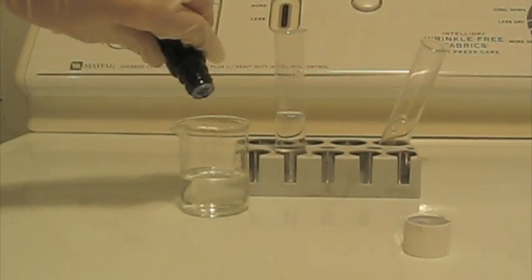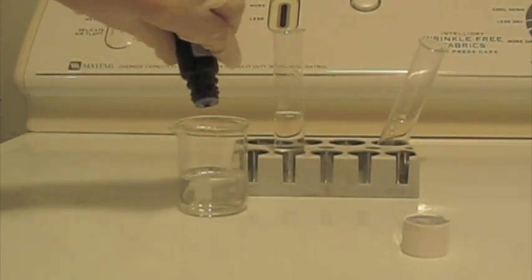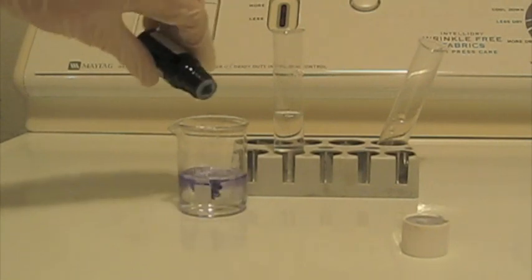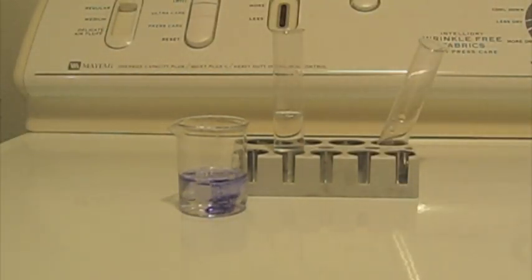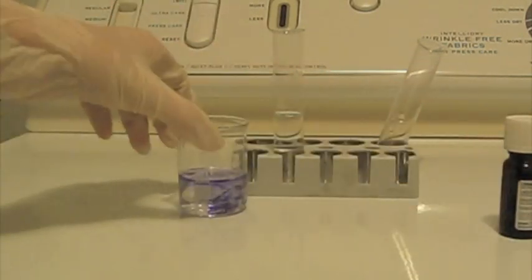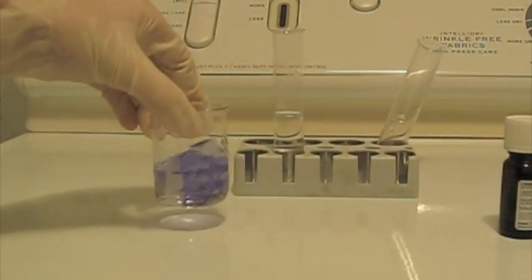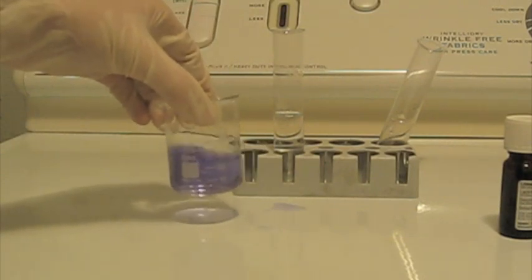To show this, I'm adding some litmus solution to a beaker with water in it. Litmus solution at a pH of neutral is usually purplish blue.